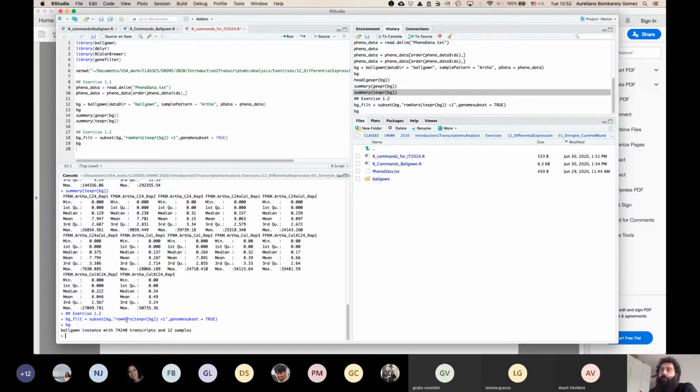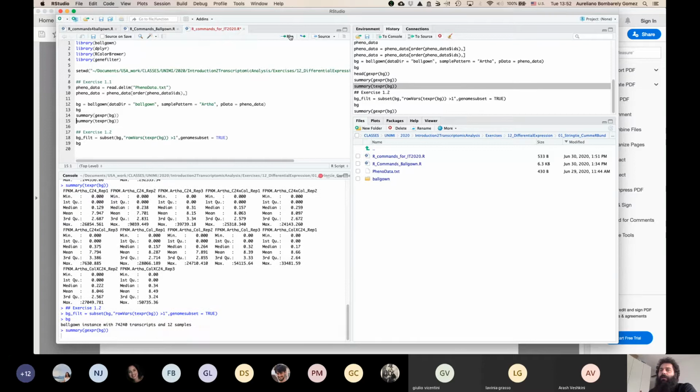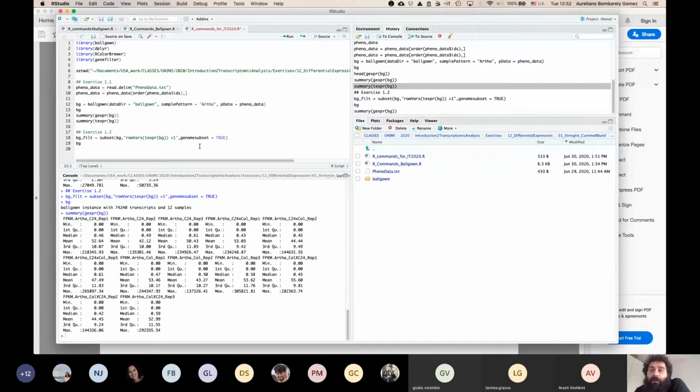And then if we want to type, for example, these commands again, it may give us slightly different results. It doesn't mean that you no longer have minimums, because maybe you will have a minimum of 0 for some of the files, but not for the other ones, okay?